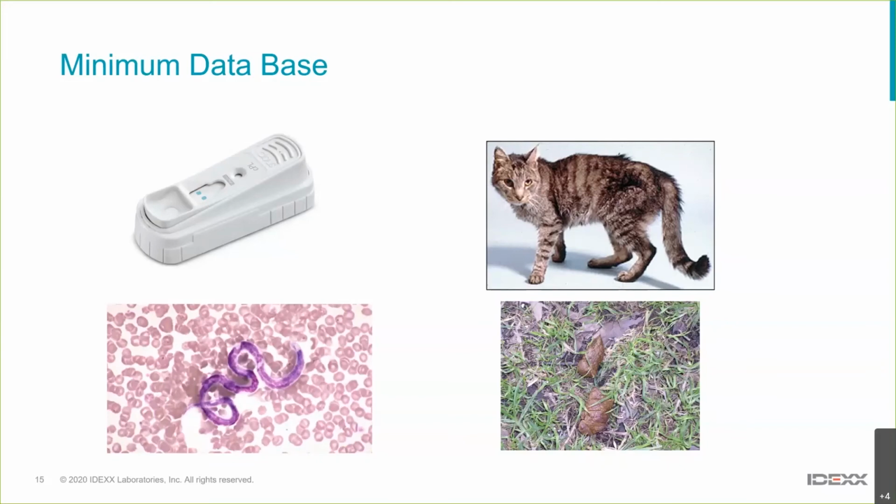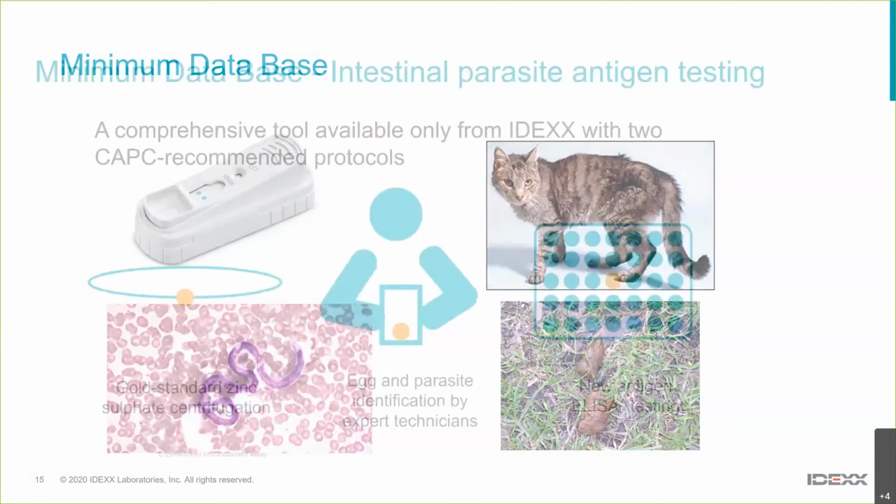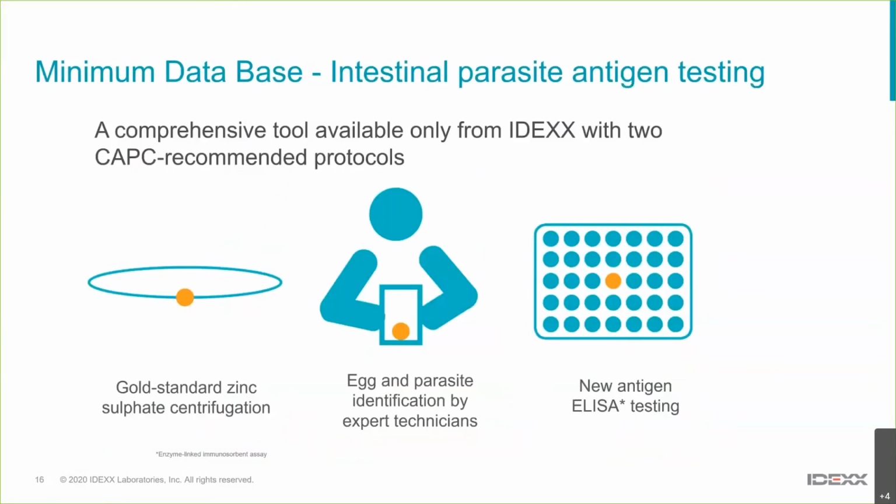There's different ways we can do parasitology. If we're worried about Giardia, we can do a wet mount looking for the motile trophozoites. Not especially sensitive, but if we see them, it's helpful to tell us. You can do a fecal flotation in-house with your simple flotation. The challenge with those is they're not especially sensitive, though they're better than doing no fecal parasitology at all. There are techniques we use in the laboratory that are more precise.